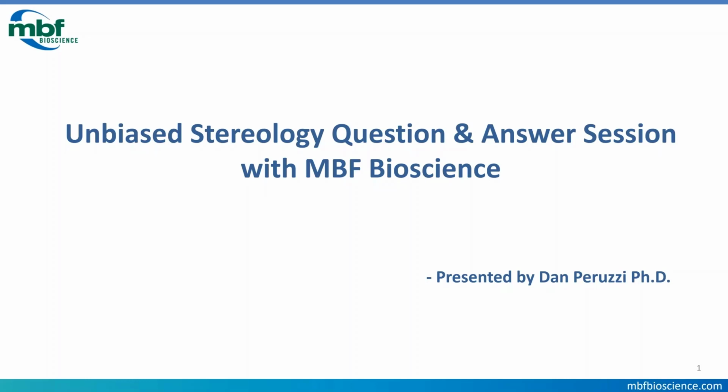Stereology is the study of solids. When we as scientists want to look at tissue at a microscopic level and study the solids that make up the tissue, we want to do it without making mistakes. So that's why the name of today's webinar is Unbiased Stereology.